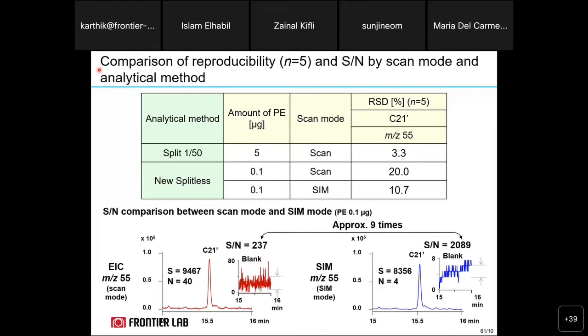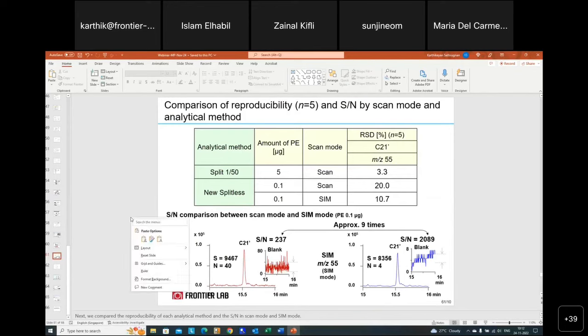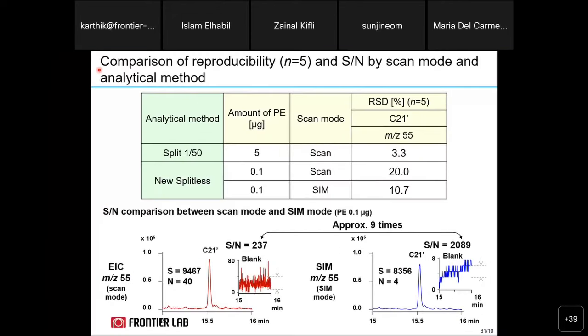So in this, we have compared the results for the split and the splitless analysis.